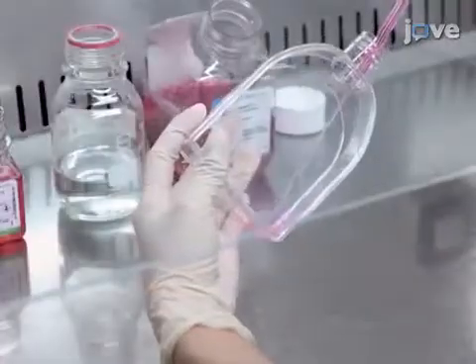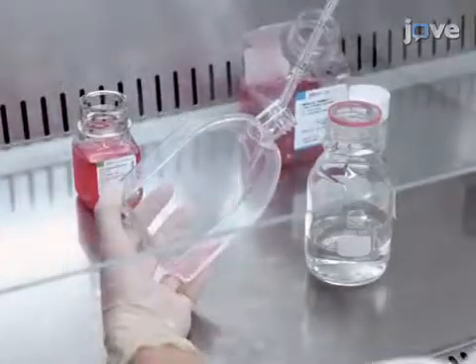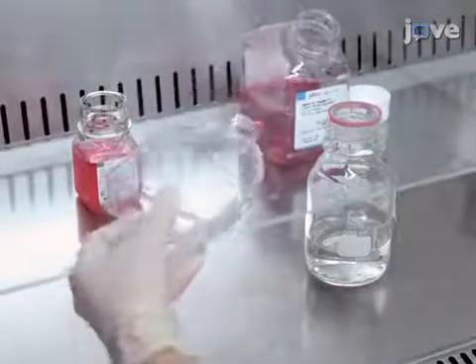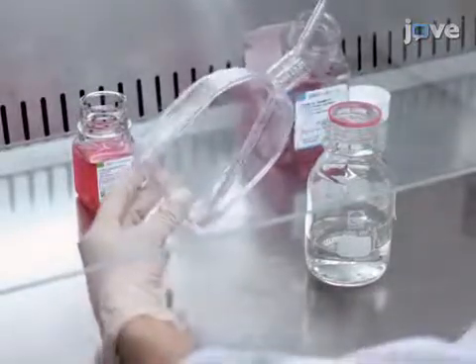To harvest the cells, remove media by aspiration and wash the cells with 5 milliliters of PBS. Afterward, remove PBS by aspiration.